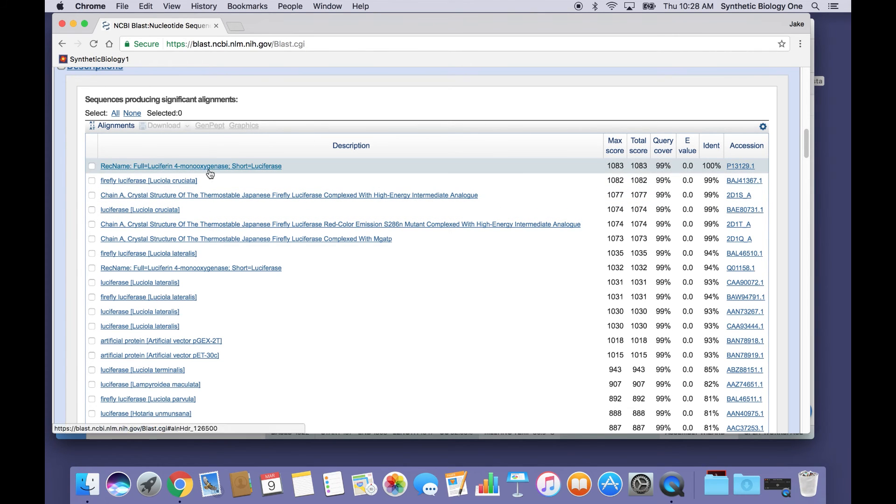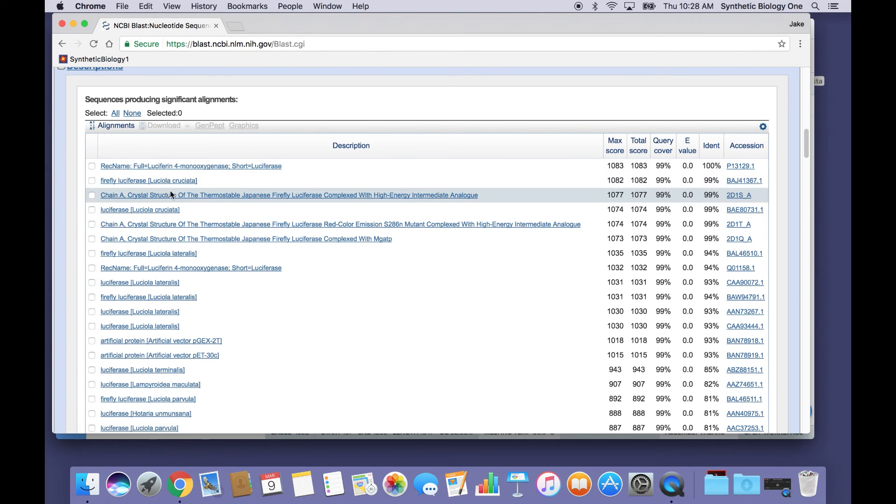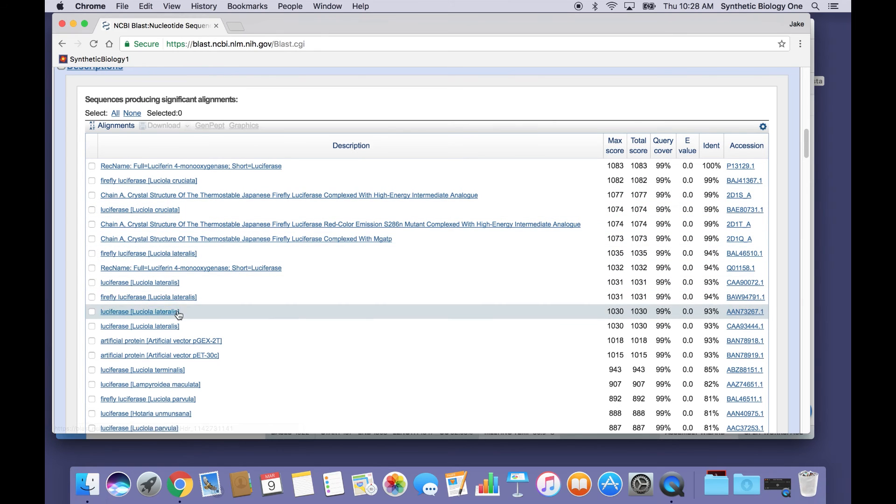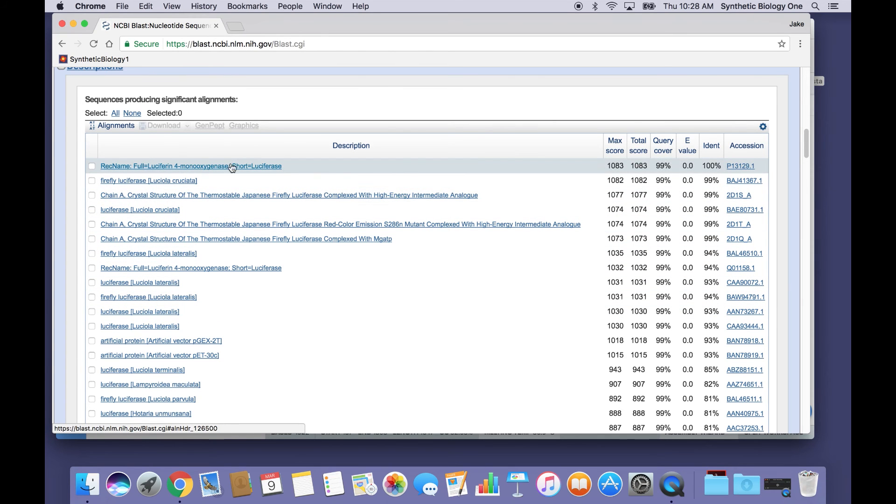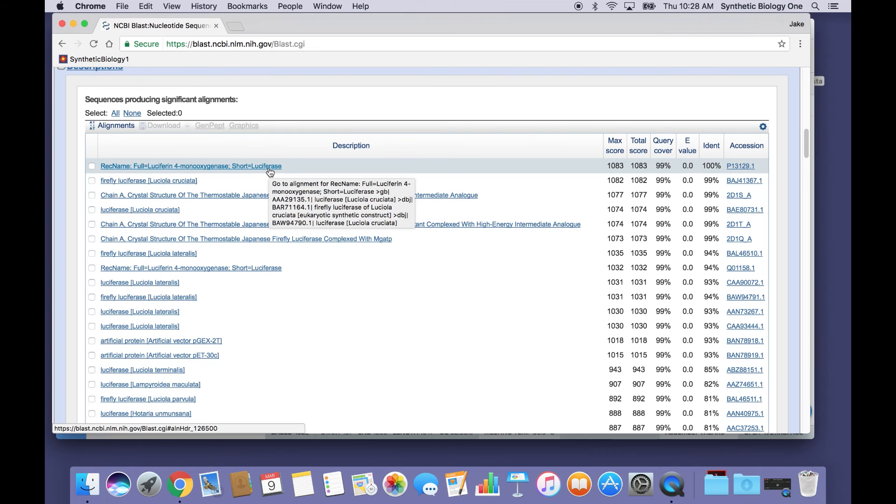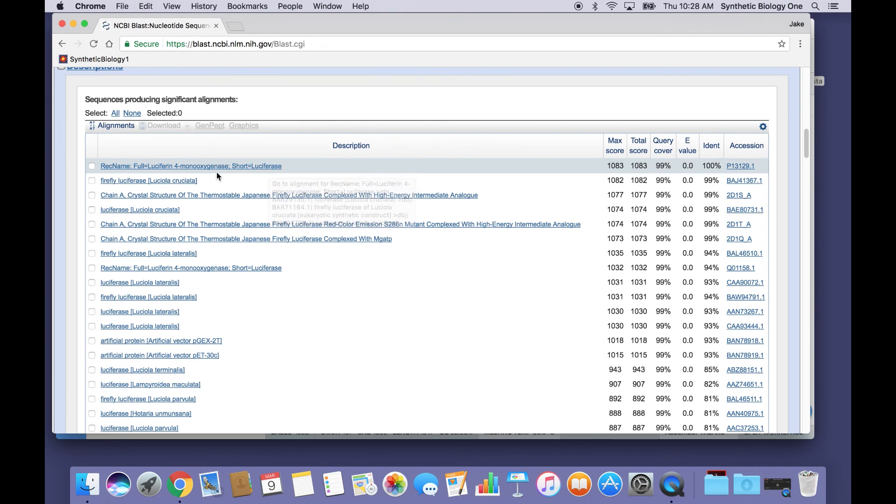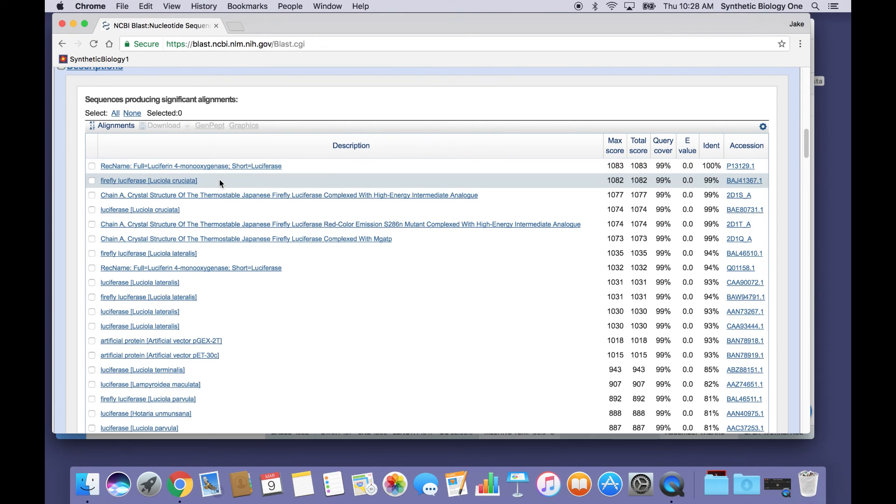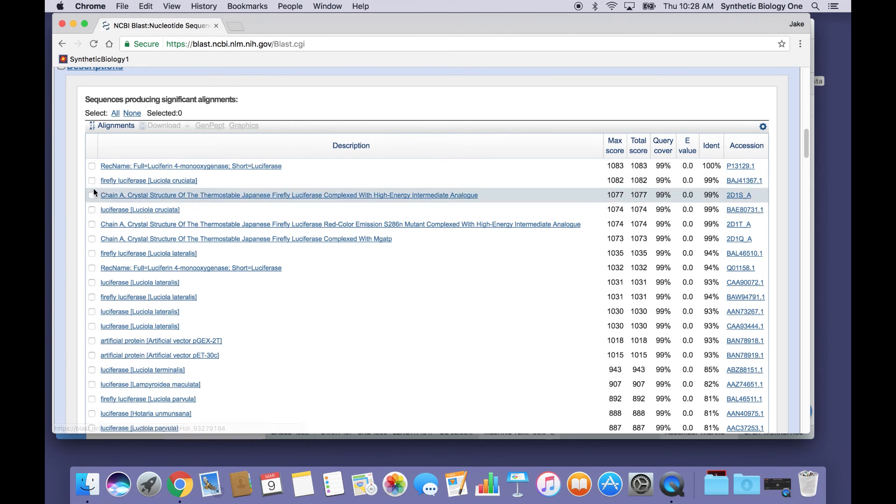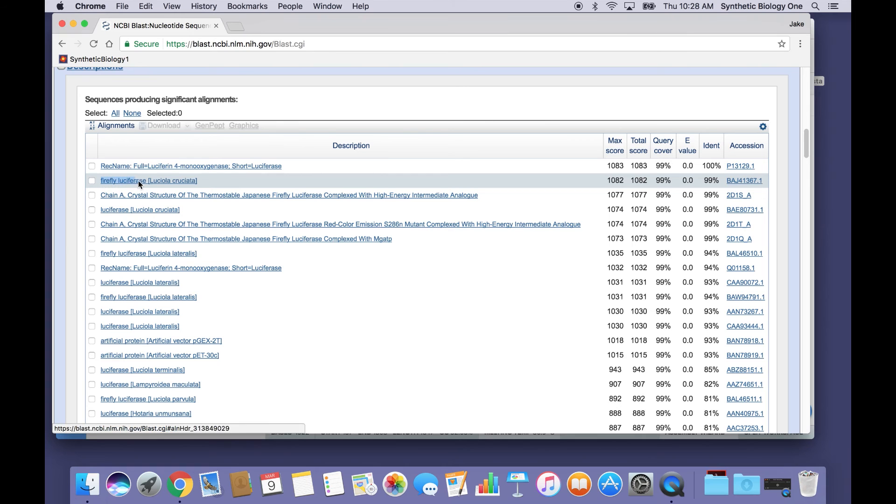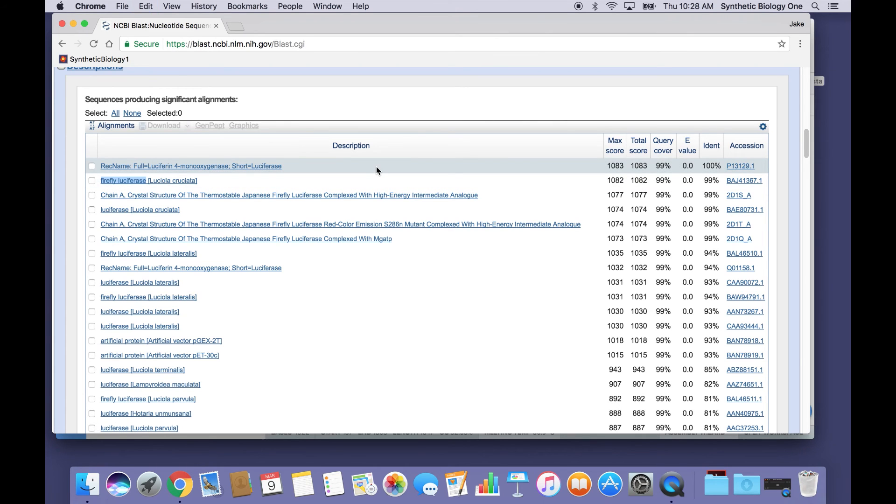And if I scroll down here, I see the names of the sequence files that I've hit. And in many cases, that is all you need to get a very important clue about what the function is of the DNA sequence that you've searched. So, for example, I can see right away here that this is firefly luciferase. So that's the name of an enzyme.